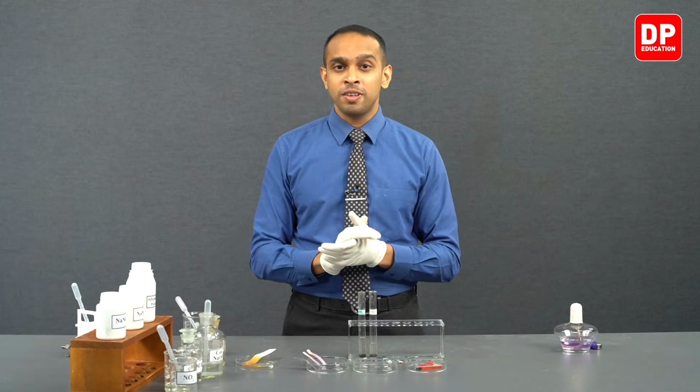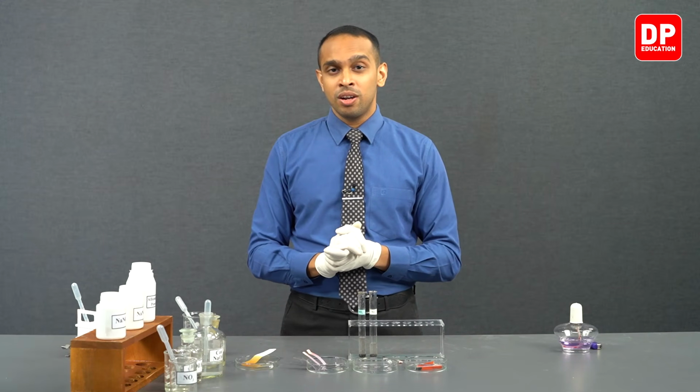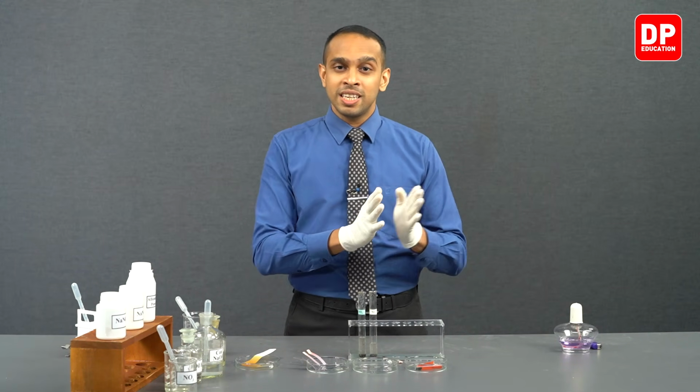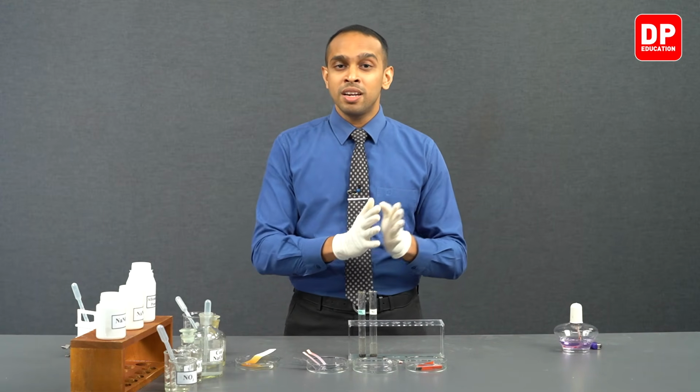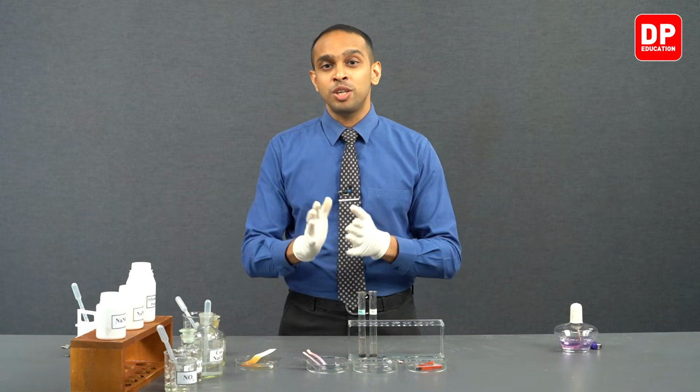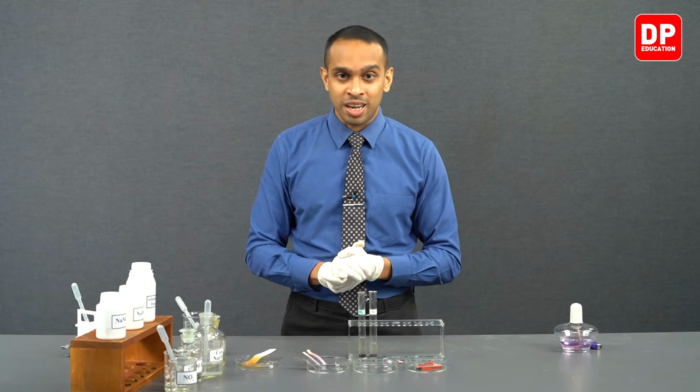In the presence of sulfuric acid, we saw that Fe2+ turns into Fe3+, while nitrate ions get reduced to form nitric oxide. So nitric oxide along with 5 water ligands forms a complex with Fe2+ ions that is brown in color.